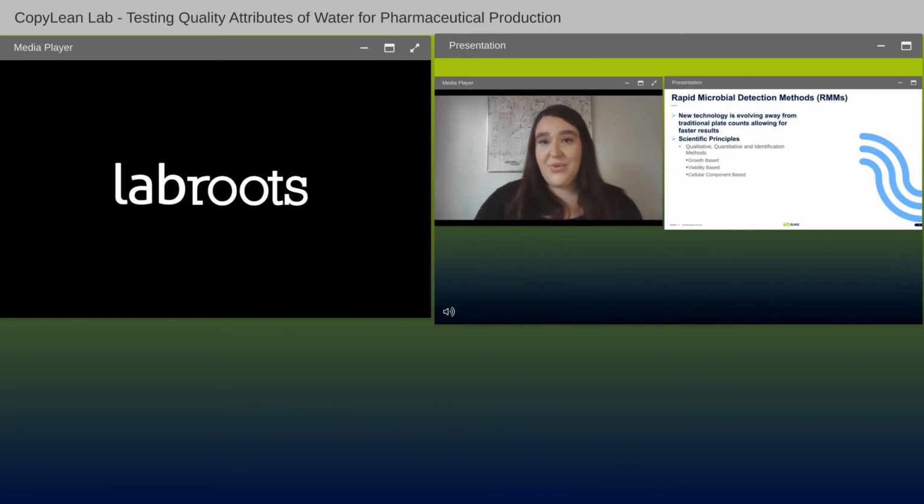So there's a new rise and a new interest in RMMs, which are rapid microbial detection methods. Rapid microbial detection methods are technologies that allow the user to get a microbiology result faster compared to traditional culture plate methods. There are 3 different categories of RMMs that include qualitative, quantitative, and identification methods.